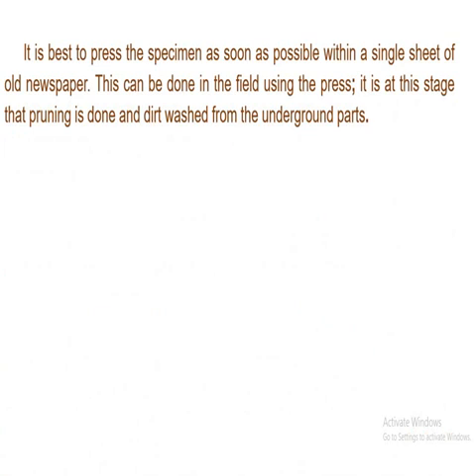Now it's best to press the plant specimen as soon as possible within a single sheet of old newspaper. Now you can do this in the field using the press. It's normally at this stage that pruning is done, so that you just remain with the exact size that you desire to have. Now you also wash off any dirt, like maybe you have collected the roots.